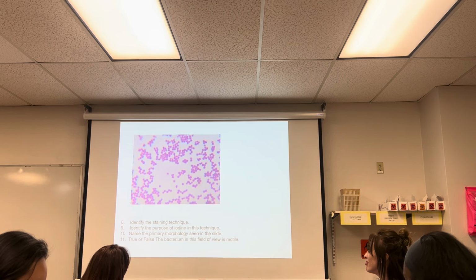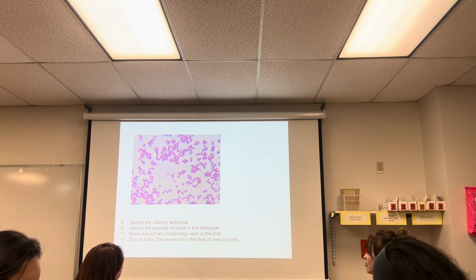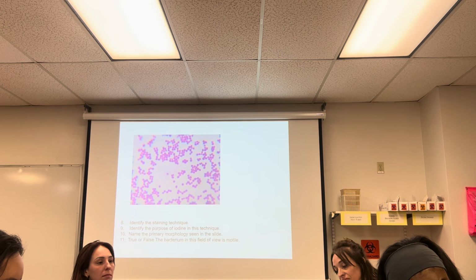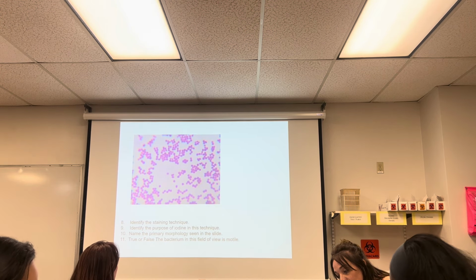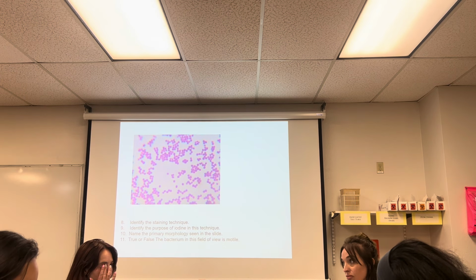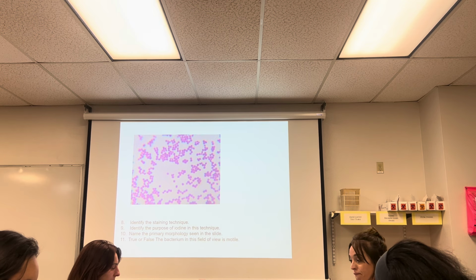Okay? True or false? Again, when you answer true or false, you write the word true or false. Your T's and your F's look the same. True or false? The bacterium in this field of view is motile. True or false? False. Why? Cocci by definition are all non-motile. Are we going to have to explain in a true or false question?